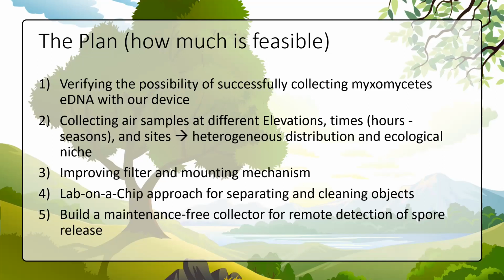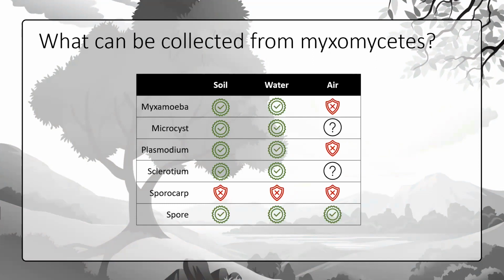Air as a sampling medium is, I think, very interesting also for a lot of you. I just wanted to mention, you showed in one of the first slides sporocarps in soil. When I do my experiments with large, high soil columns and porous soils where you have large pores, these are not single observations.